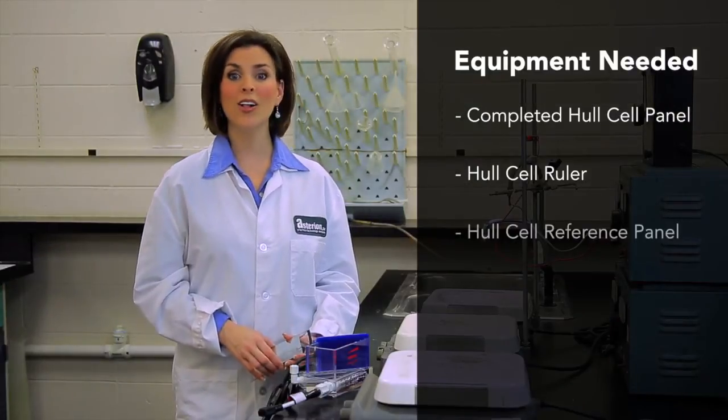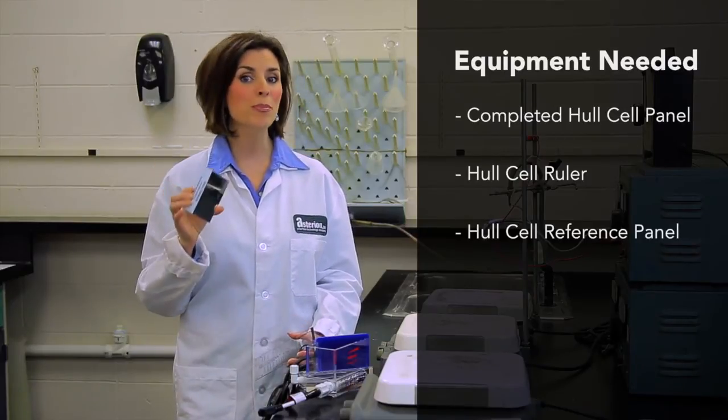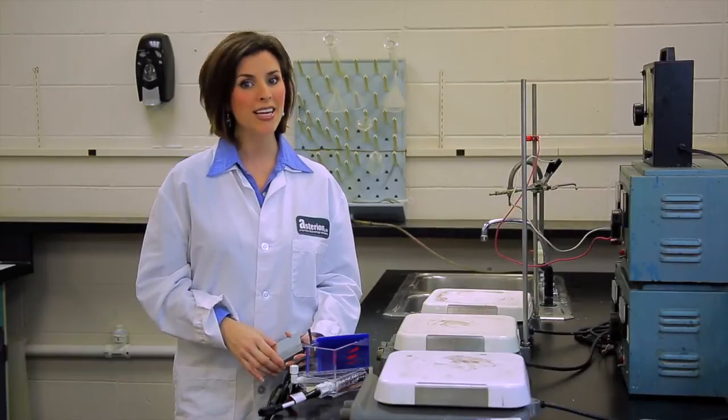It's always important to retain a hull cell reference panel for comparative purposes. The reference panel should be obtained when the bath is operating at its full potential and in a stable condition. The reference panel will be used as a standard to compare the test panel.